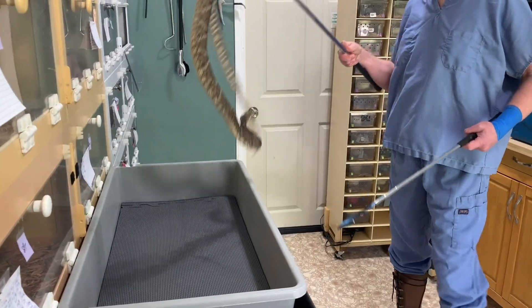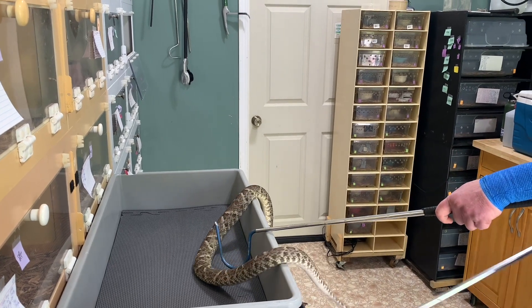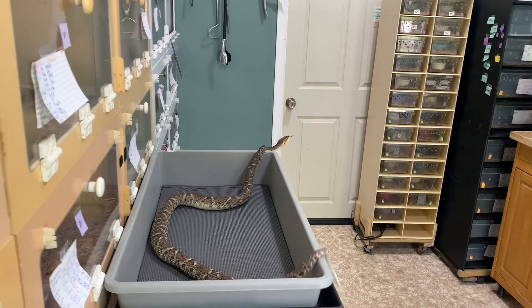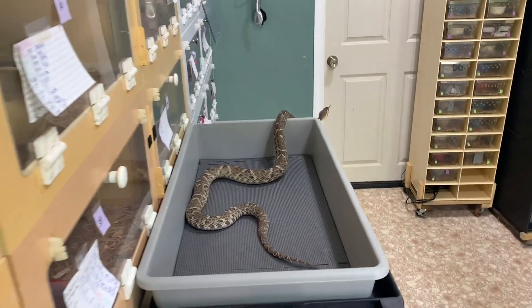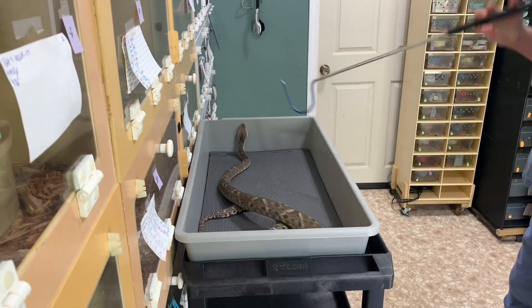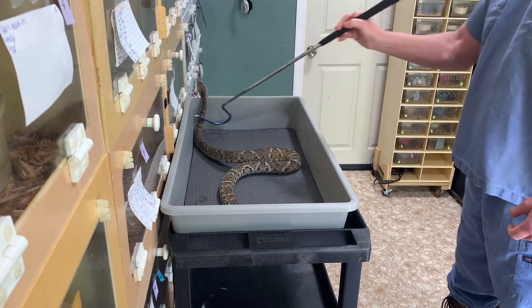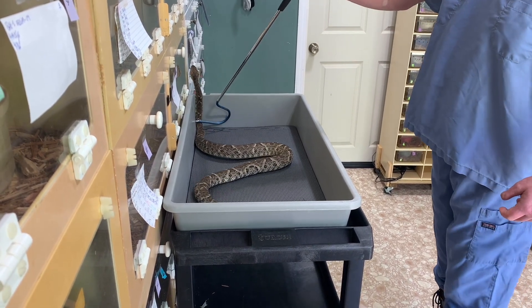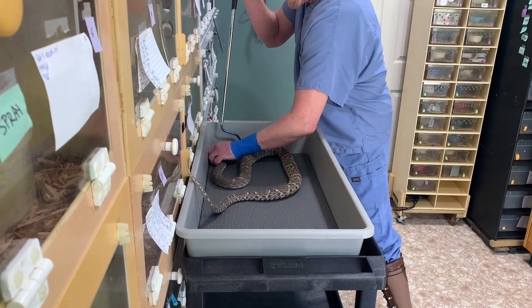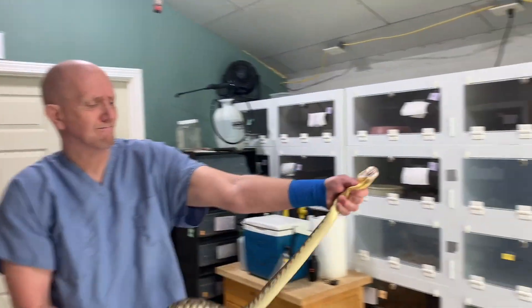Hey everyone, today's video is Bothrops atrox from Colombia, the Colombian Lancehead Viper. In this video you're going to see a few adults — this one and the next one are the mother and father of some juveniles, which we will see later in the video. But for now, here's some adults.